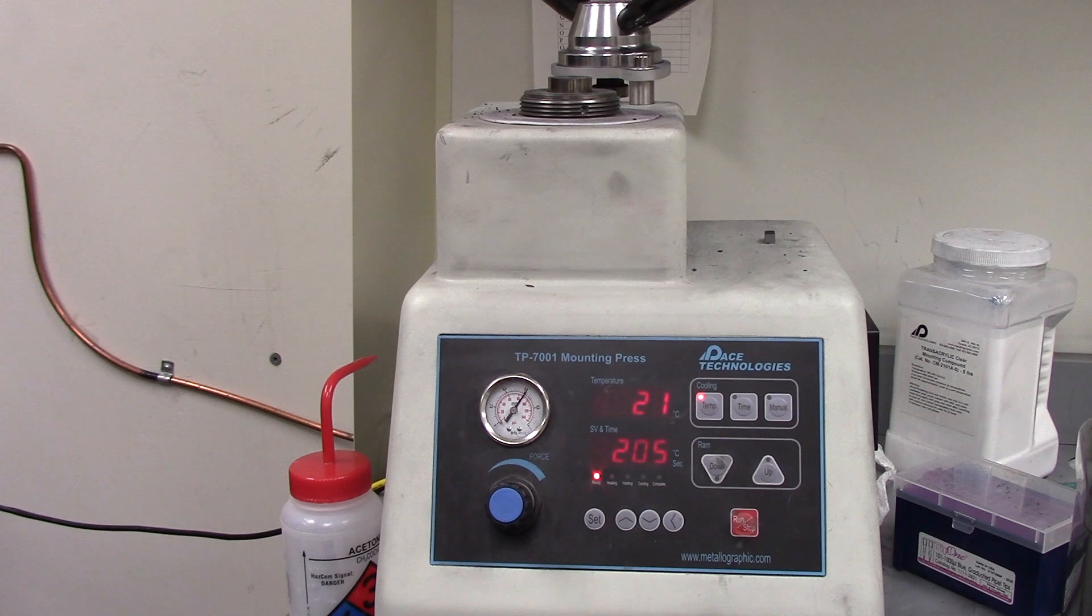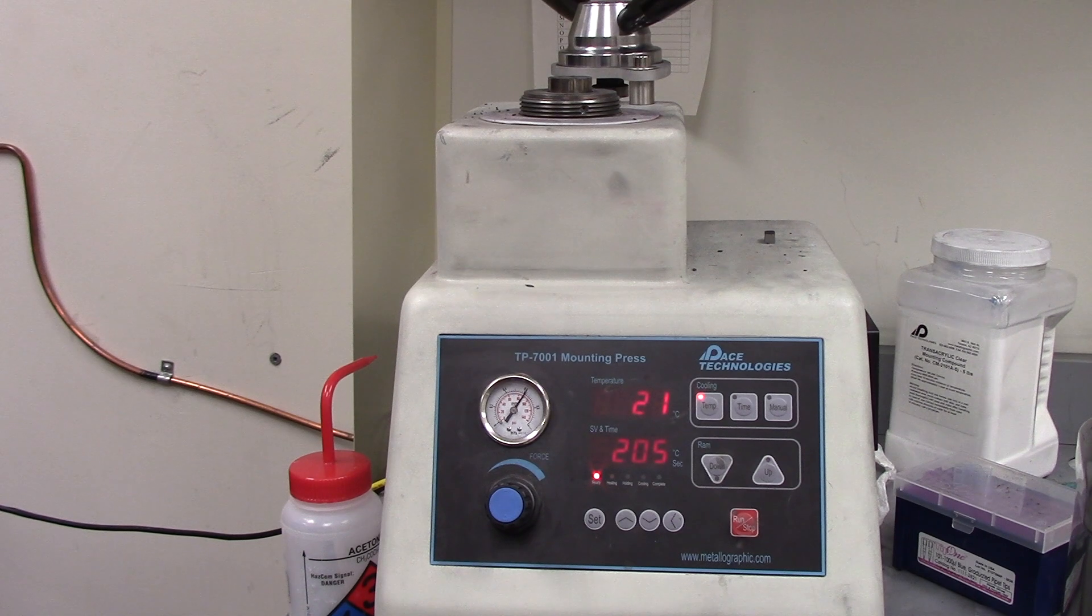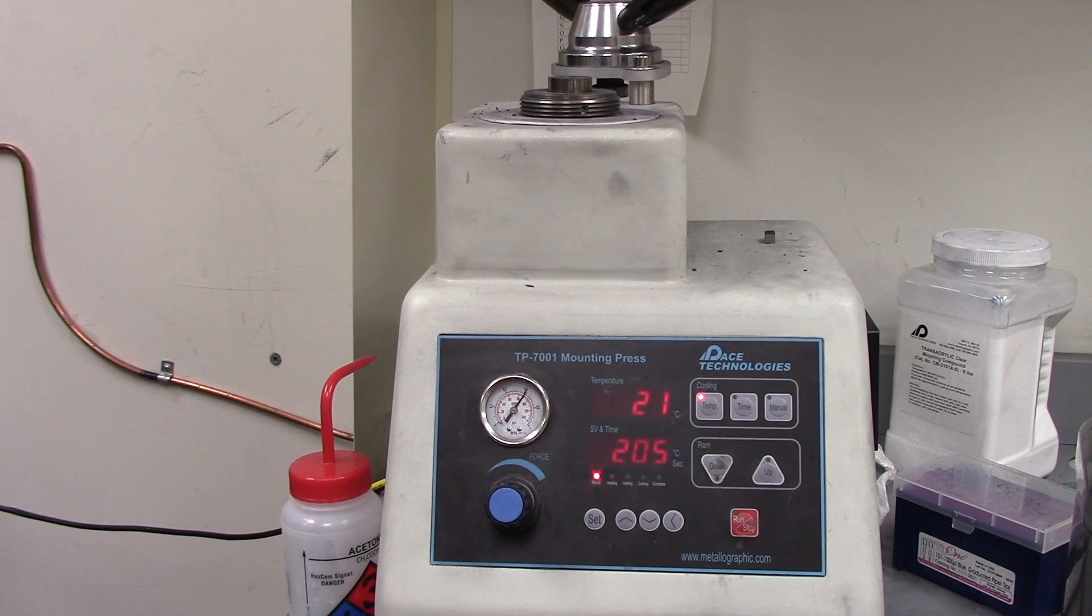At Hopkins, machines such as the TP7001 mounting press are the primary method for mounting samples that have a high tolerance to heat and pressure. With a wide number of mounting powders of different compositions available, you can use this method to mount materials such as metals, semi-conductive wafers, and ceramics.